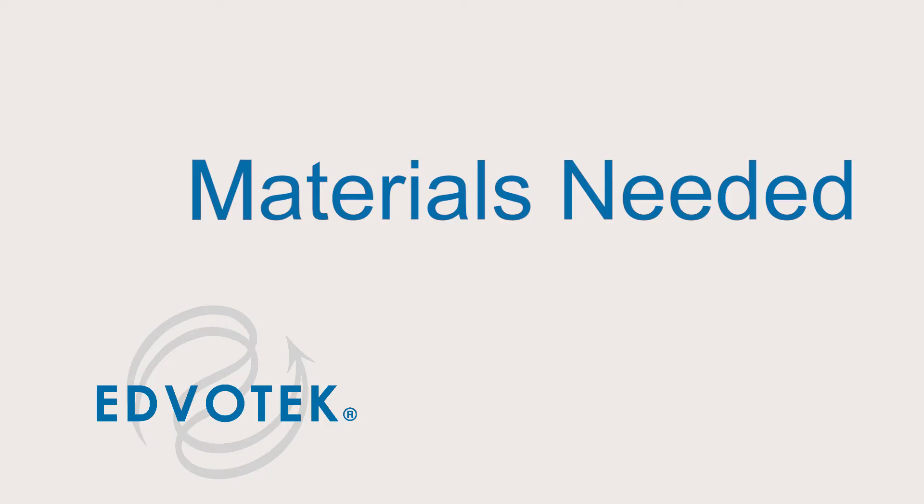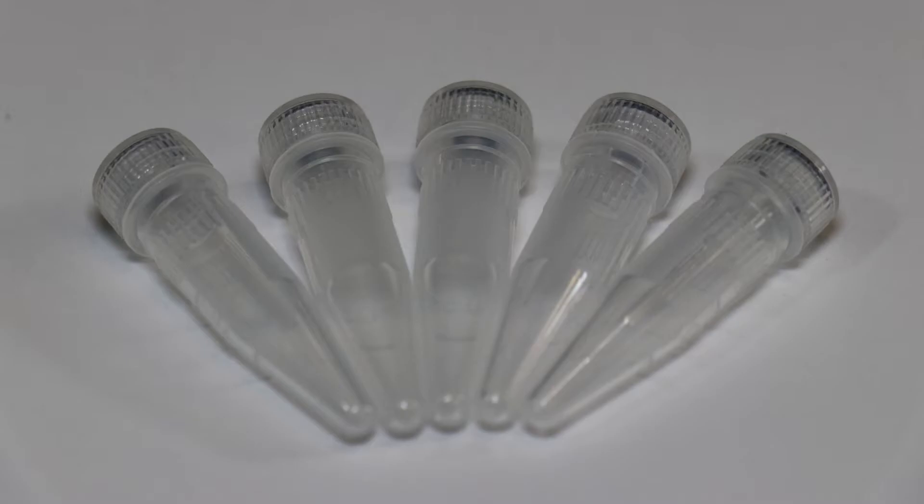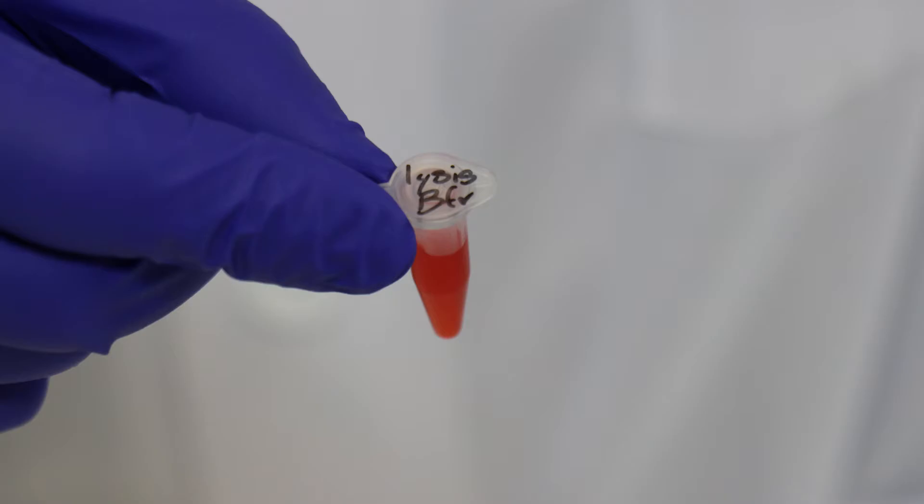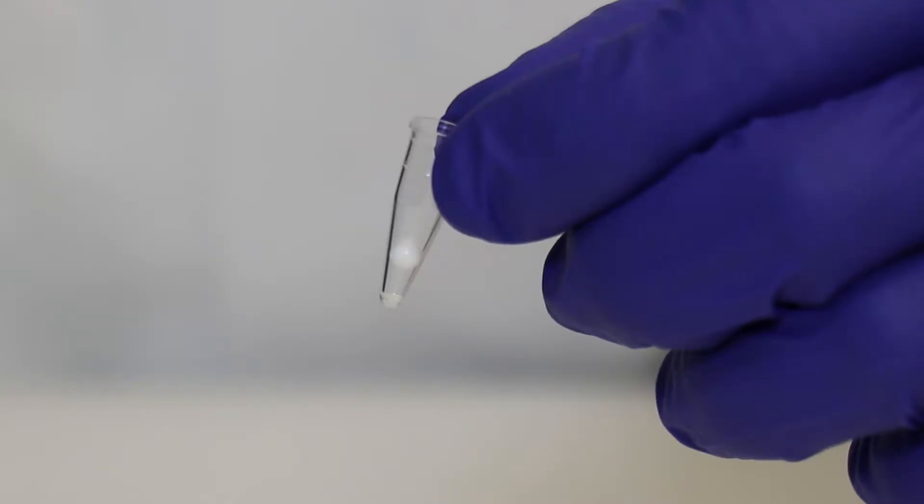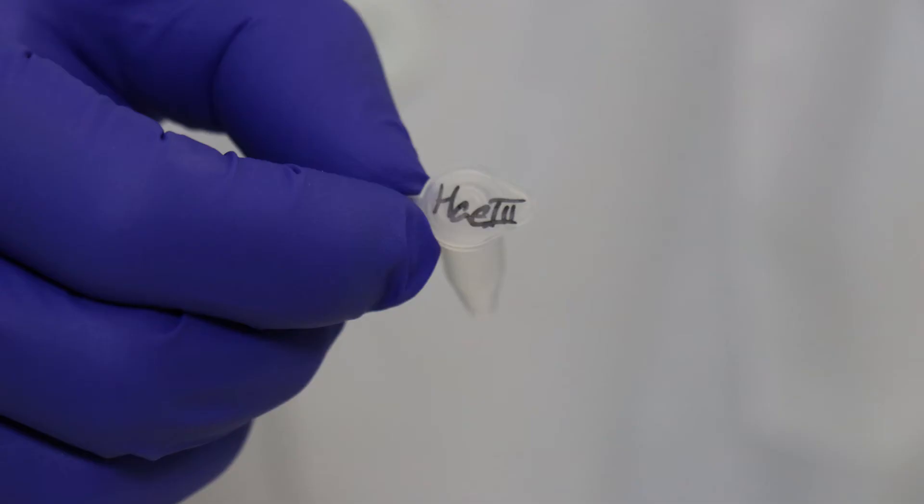Before beginning this experiment, you will need one cup containing 10 milliliters of saline solution, screw cap centrifuge tubes, snap top centrifuge tubes, 300 microliters of lysis buffer, one tube containing a PCR Edvo bead, 90 microliters of PTC primer.